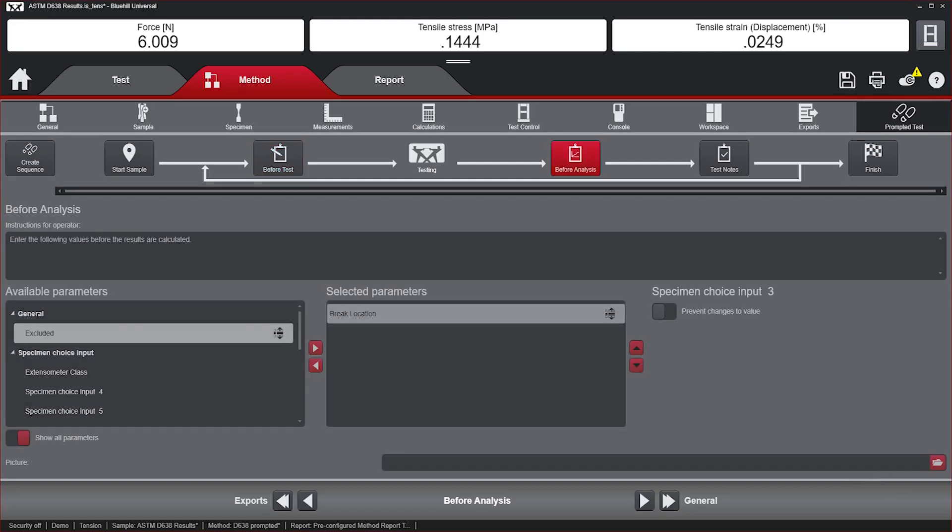Before Analysis is used when calculations require information from the operator, such as using the cursor select to identify points on the graph or the failure mode of the specimen.